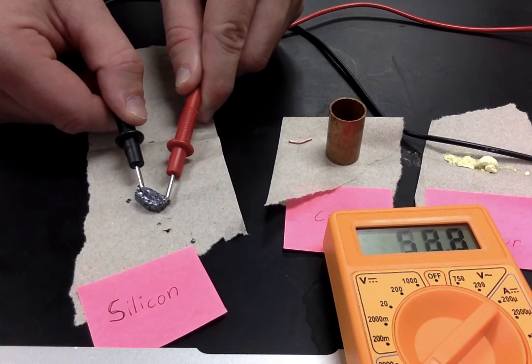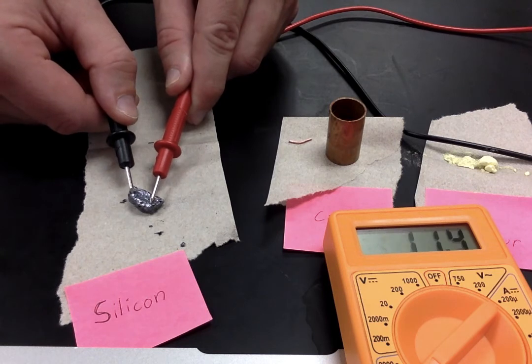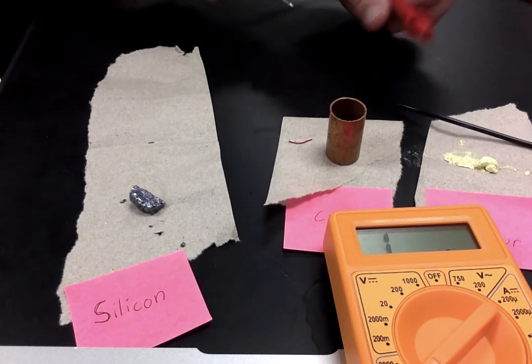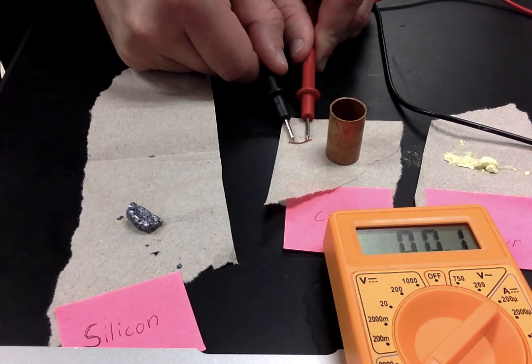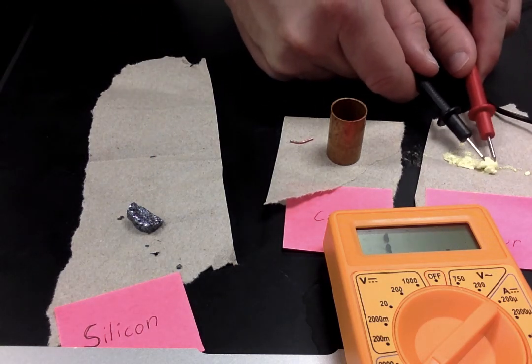There we go. So you can see the numbers are kind of all over the place, but that should give you some sense of how high the conductivity is. Next, let's use copper, and I'm going to do the wire. Okay, and then last up we're going to do sulfur.